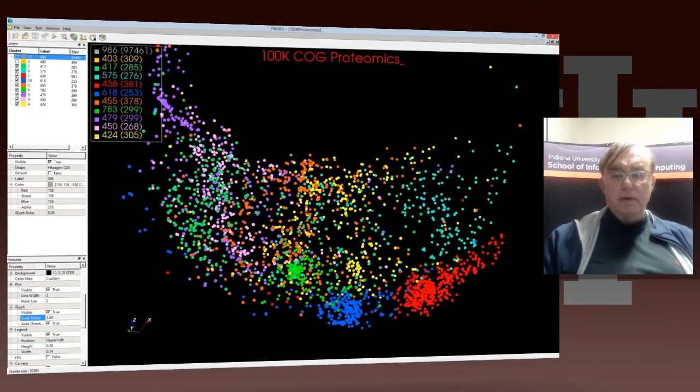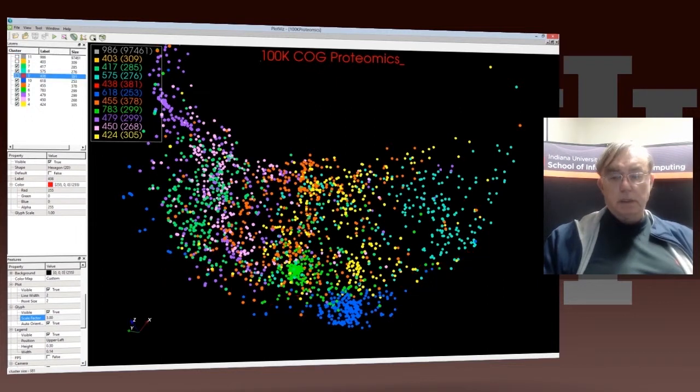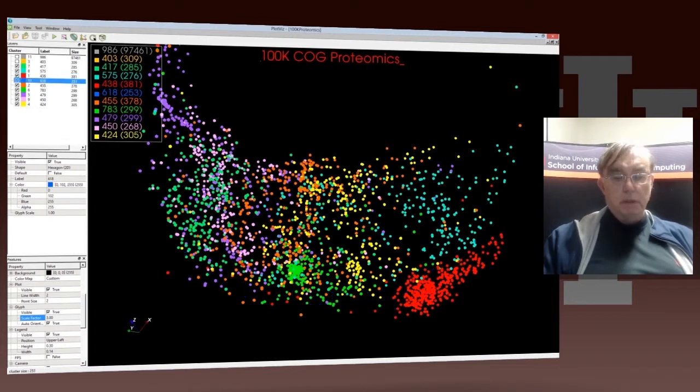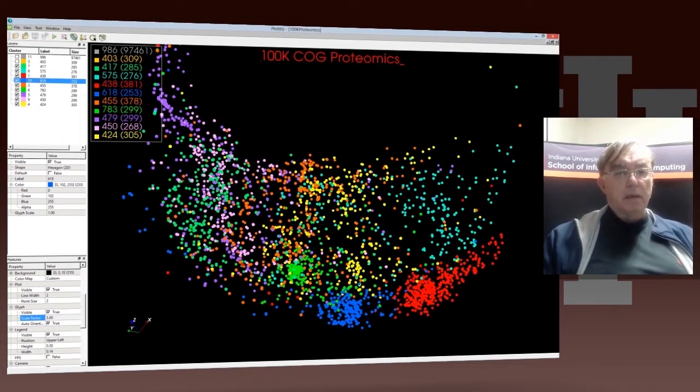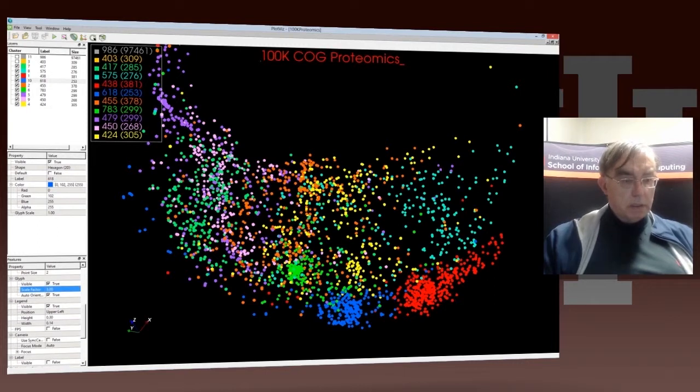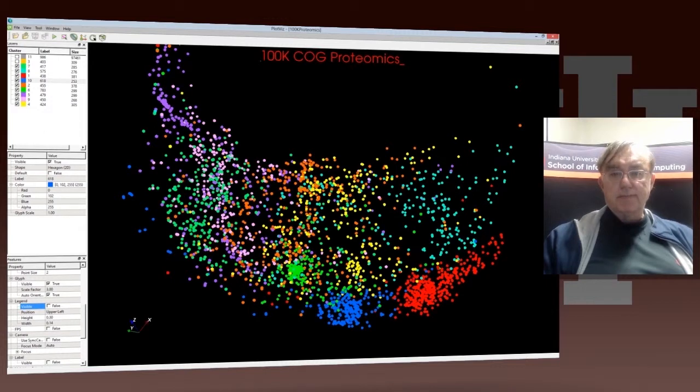So you can go back. You need to play around and get what you want. Here's a nice red one to verify what we understand. It must be this one here. That red one is pretty nicely clumped, as is this blue one, which is probably this one. You see, when you get rid of it, you can actually see your eye tells you where they are. There are a few over here, most of them are here. So you can suggest maybe these ones over here are just some problem, not quite certain what it is. If you find this legend is getting in your way, then of course you can always get rid of the legend. There we go, the legend. So that illustrates what you do in these things. That's it for that.